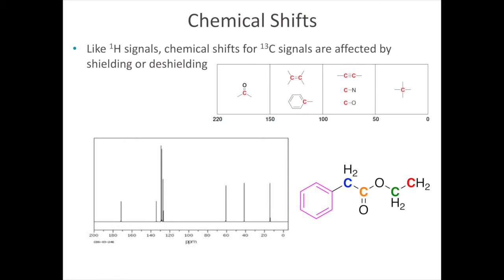The easiest one that stands out here for me is this very high chemical shift, around 170 ppm. What could that correspond to, right? This must be a carbonyl, so this must be the orange carbon here of this carbonyl. Next we have these clusters around 130 ppm. So 130 ppm must mean some kind of aromatic or alkene. Indeed, it is the aromatic of the compound.